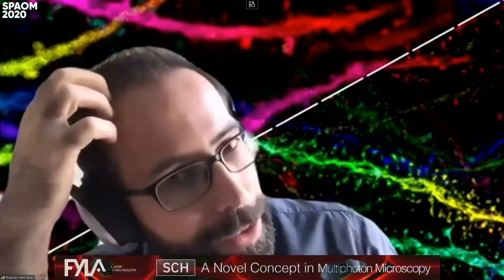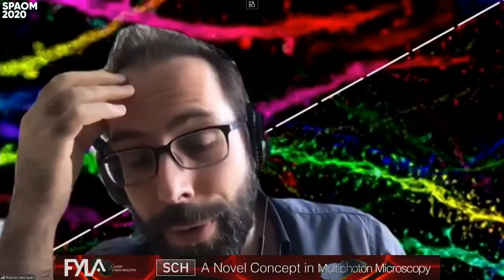So, I was telling you, sorry about that interruption, by the way. I started the lab, wrote some first grants, and here is some of the feedback that we had. From Human Frontiers, this would be a great project for cryo-EM. From the MRC, Super-resolution in general should be seen at face value as a sophisticated way of analyzing blobs that can only be complementary to high-resolution EM. So I was obviously annoyed with some of this feedback, but there is some grain of truth in here also, which is: what have we seen with super-resolution that we have not seen by electron microscopy before? And the answer is there's very few things.